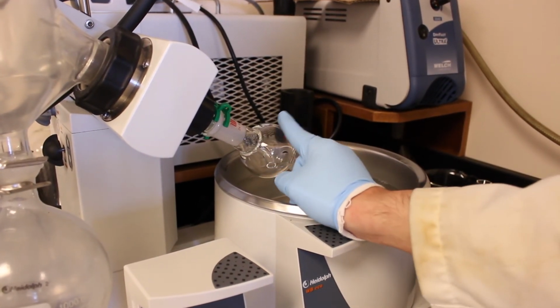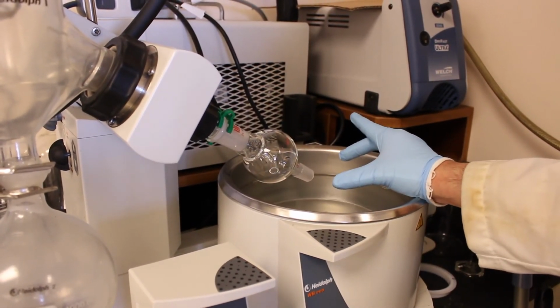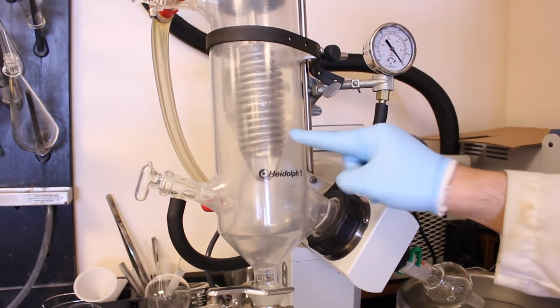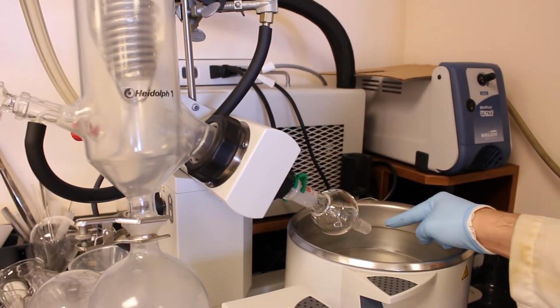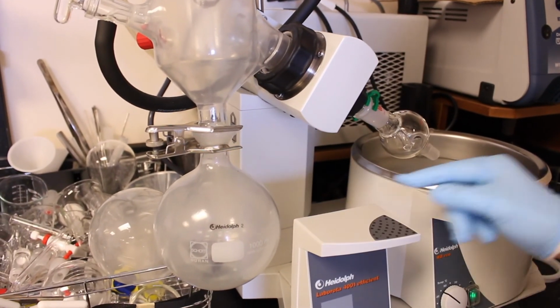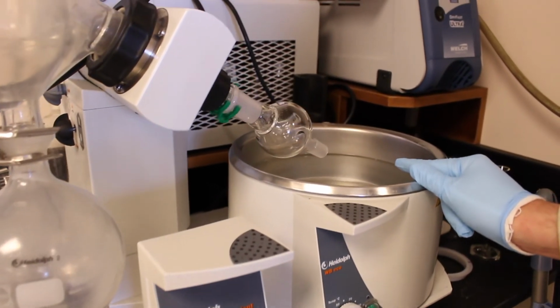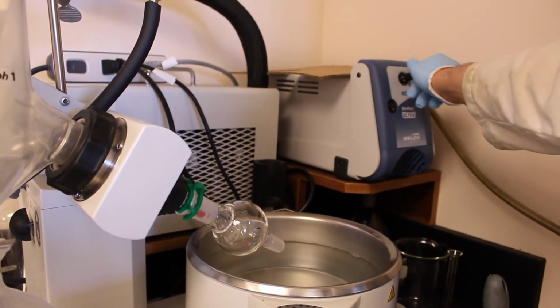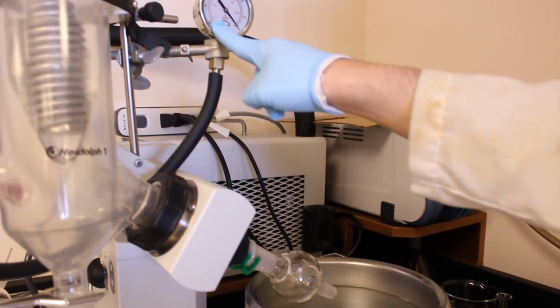Now, this joint is a bump trap, and we'll cover that in a little bit, but we have our heating, boiling mixture here, and then it's going to be connected to this condenser here. So this condenser has cold acetone, which is chilled by this chiller here. And it's going to vaporize all of the solvent here, travel up this steam tube, and hit the condenser and fall into the solvent trap here. And when we turn on the rotation, maybe you can see, it'll rotate our flask. And vacuum is provided by this vacuum pump, and you can control the strength of the vacuum using this needle valve. And you can read the vacuum using this pressure gauge up here.